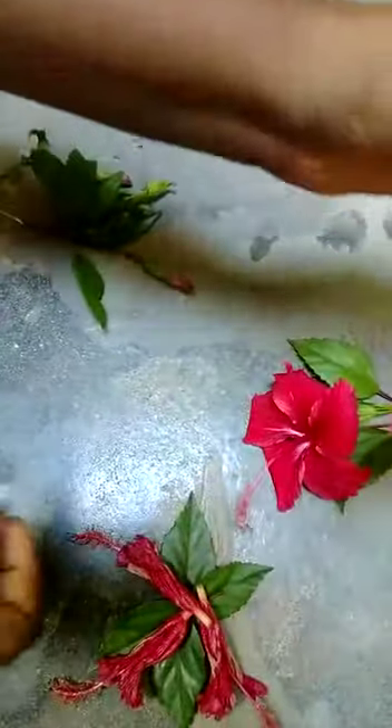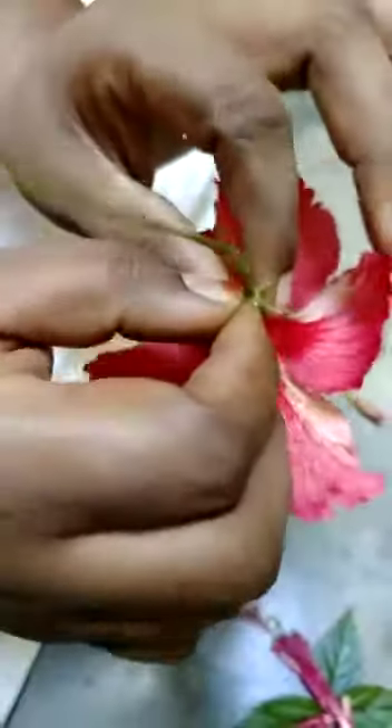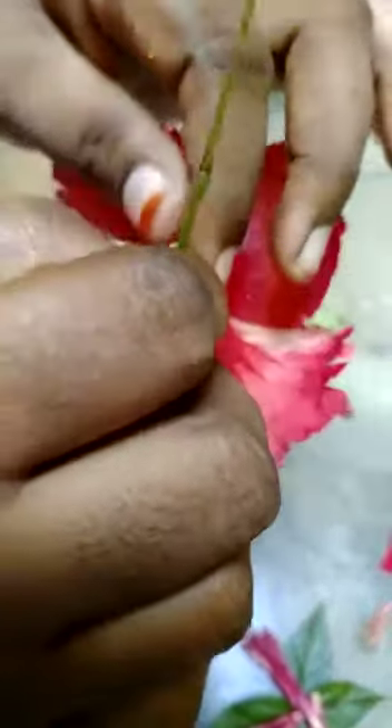I will tell you step by step how to dissect a flower. Turn the flower like this. Before that, I want to tell you we have to handle the flowers — not only this hibiscus but all flowers — in a soft and smooth manner.